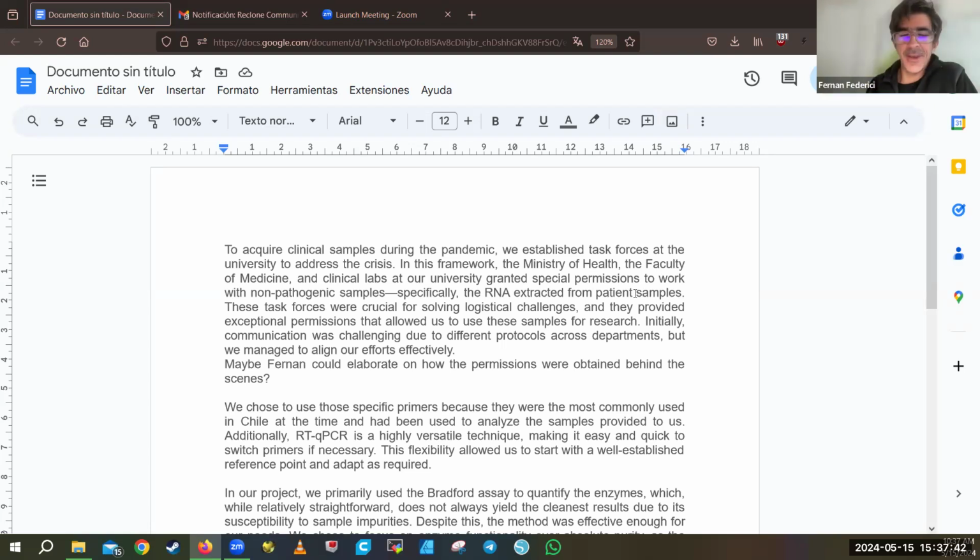Yes. Hi. Yeah, we have been using them, as Ariel already mentioned, with the collaborators in the project like Cesar and other people in our lab. Some students kept working with some of the enzymes, for example, preparing samples for PCR fragments to be sequenced.